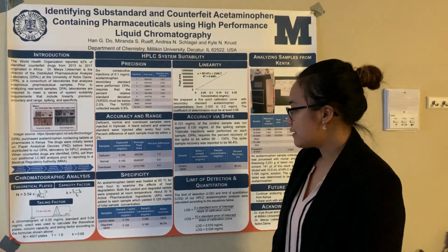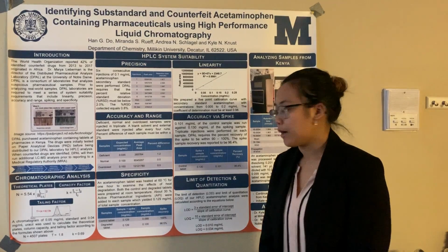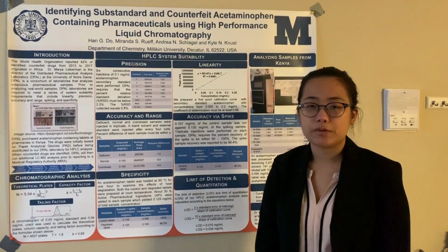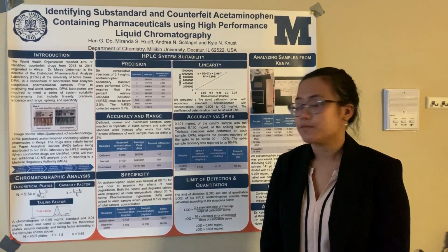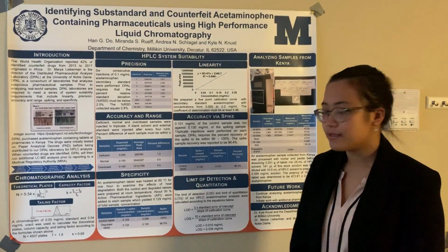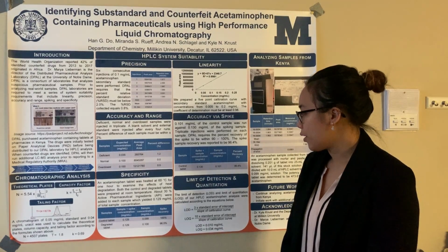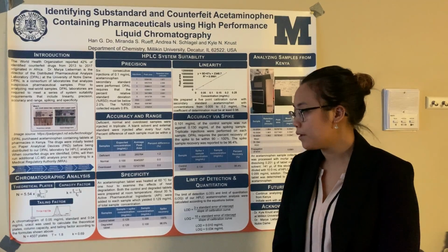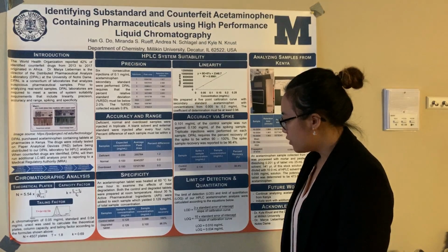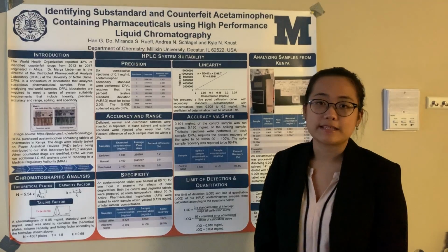Specificity. An acetaminophen tablet was heated at 60 degrees Celsius for 1 hour to examine the result of heat degradation. Both the control and the degraded tablet were processed at room temperature. About 30% of active pharmaceutical ingredient, API, was injected into each sample, which yielded a 0.129 mg/ml total sample concentration. For the control tablet, I have 100% spike recovery and 96.5% for the degraded tablet.